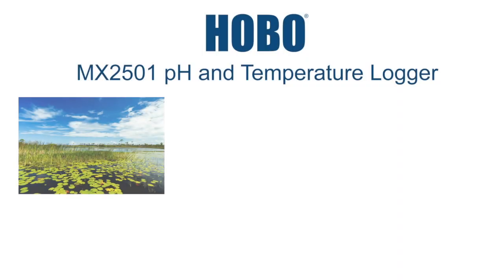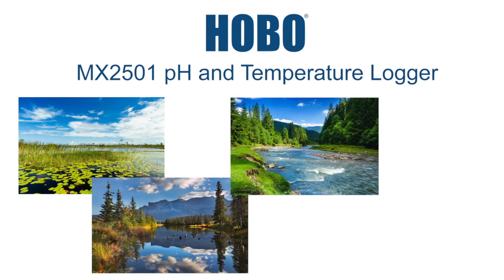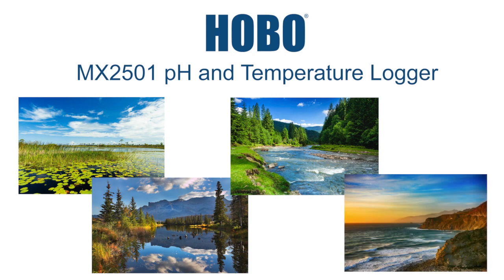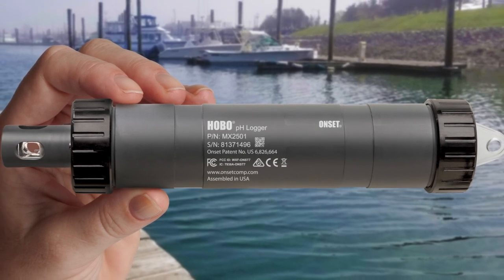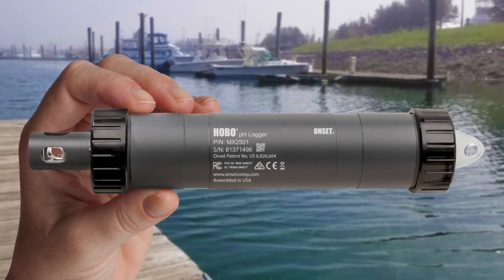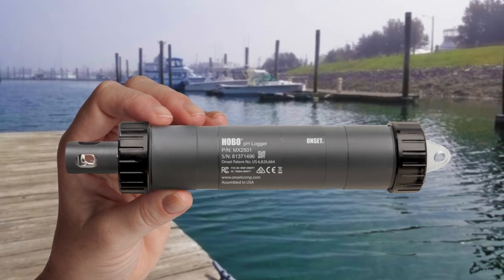The Low-Cost HOBO MX2501 Bluetooth pH and Temperature Logger is designed for long-term pH monitoring in estuaries, lakes, streams, rivers, and oceans. At only 9 inches long and with a durable PVC housing, the HOBO pH Data Logger is compact and rugged, making it ideal for both saltwater and freshwater environments.